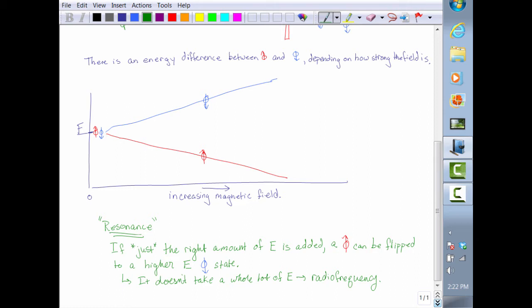So you all have an NMR in front of you. Check it out. All of the peaks that you see on that NMR are places where your nuclei have been put in resonance after a magnetic field has been applied. So you can see that there's peaks at different places, right? And that's because for each type of hydrogen that's in your sample, it takes a little bit different amount of energy to put it in resonance. And so the machine actually measures the absorption of that energy, or where that energy is absorbed.